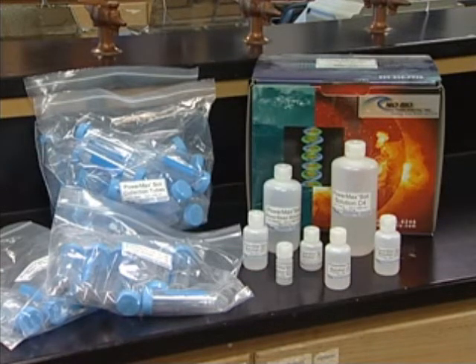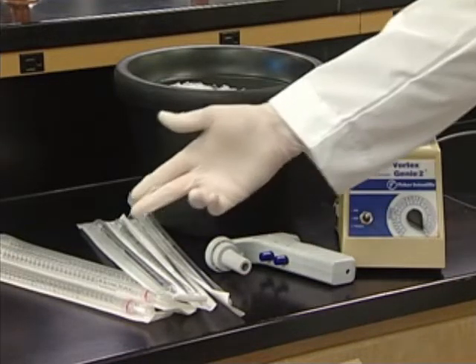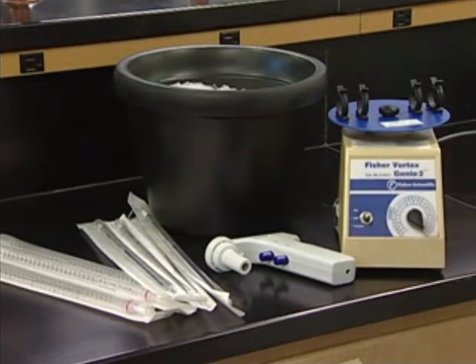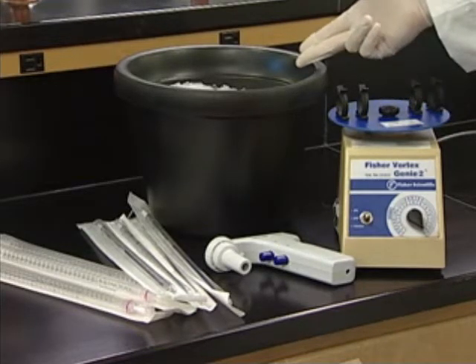Throughout this protocol, latex gloves should be worn at all times, as the natural DNA enzymes on your skin can easily degrade your product if you should happen to touch something going into the mixture. Additionally, you will need access to some pipettes, both 5ml and 25ml, and some sort of bulbar apparatus to use with the pipettes, like this automatic pipetter. Finally, a centrifuge and vortex will be required, as well as a bucket of ice to complete the procedure.